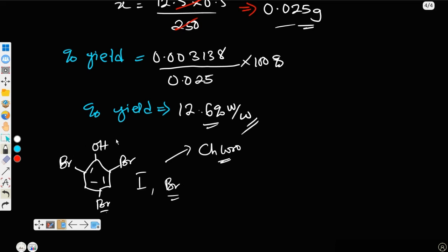Why will the thiosulfate only react with the aqueous layer? Because the aqueous layer is where the reaction will be formed. Is that okay? So that is everything you need to know about this practical. And then that of isocyanide, we should just hope for the best.